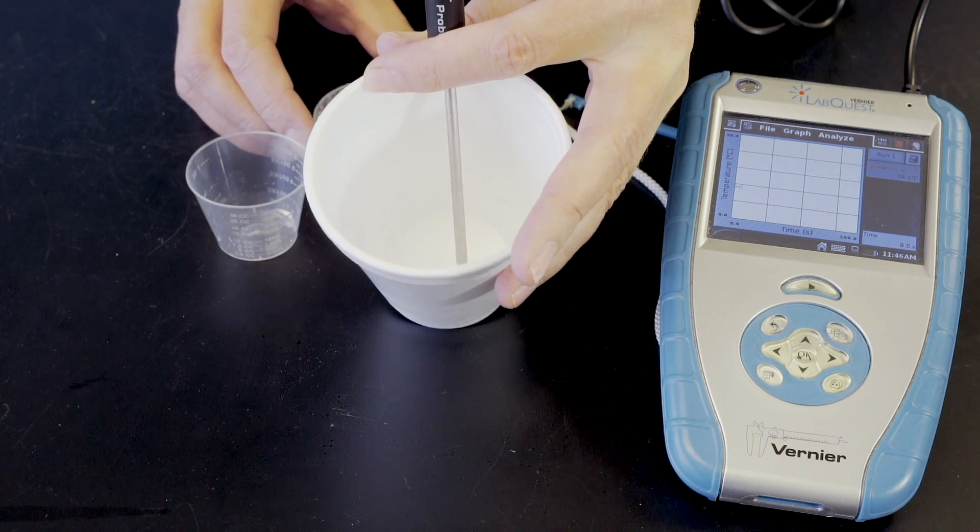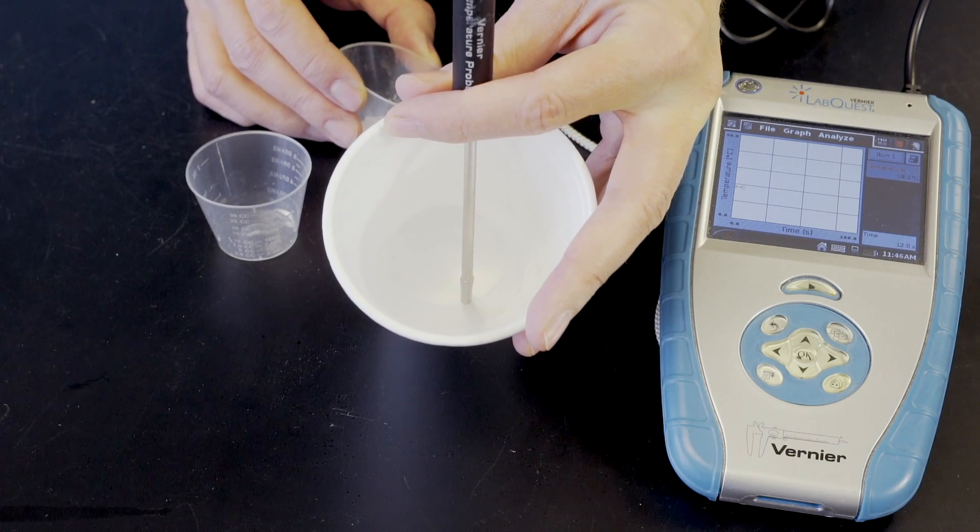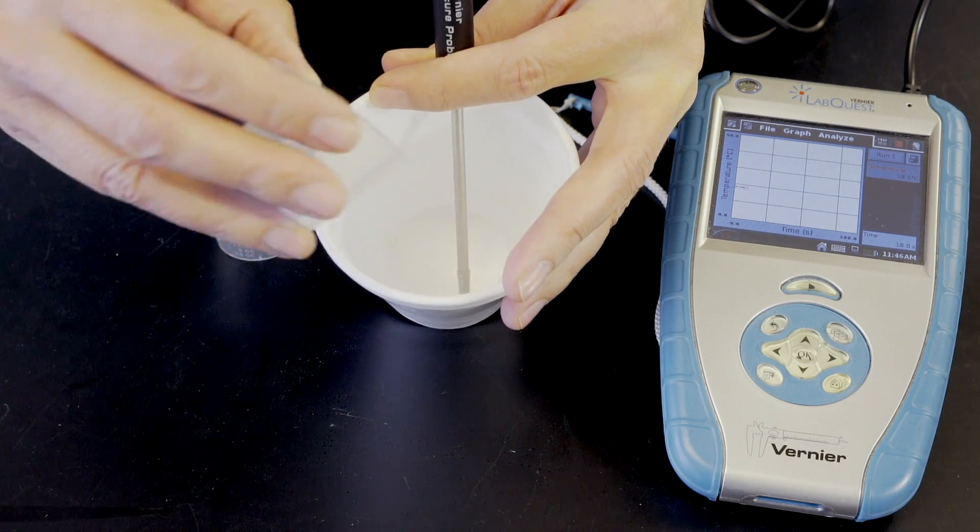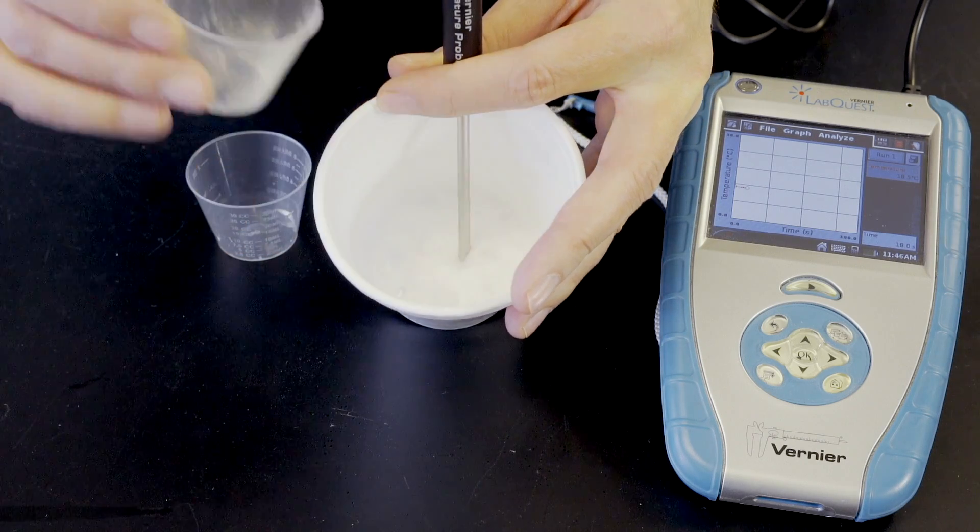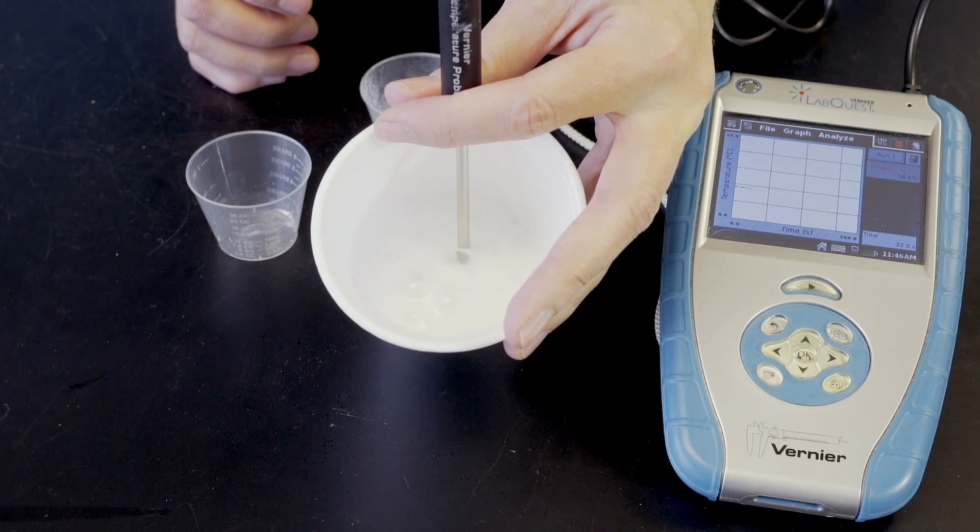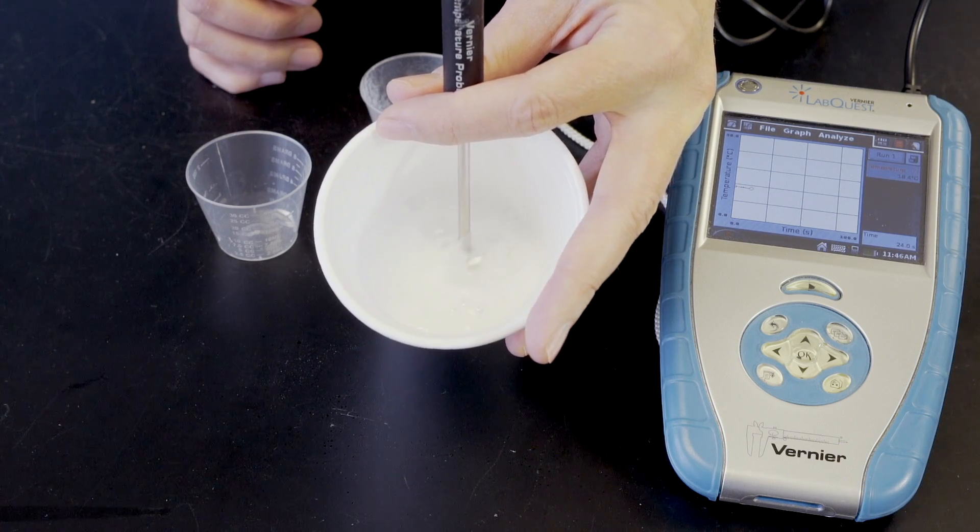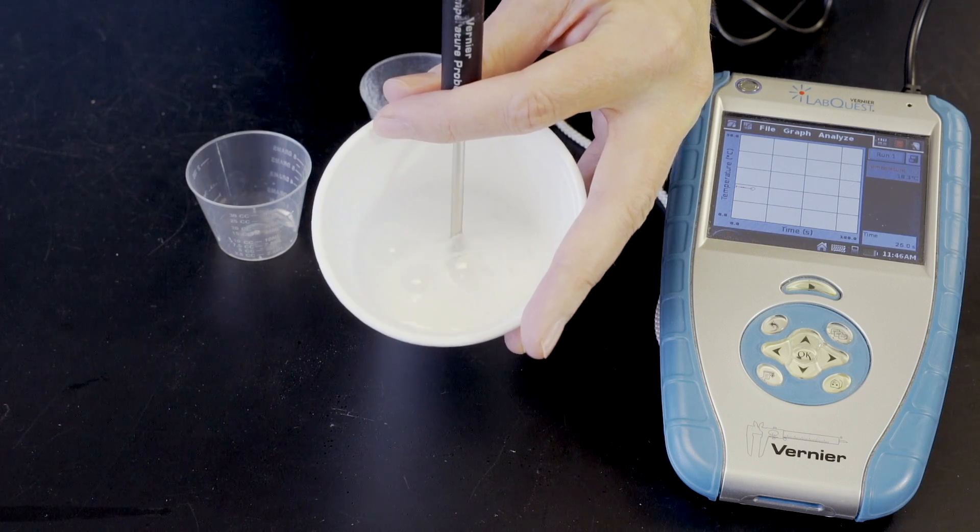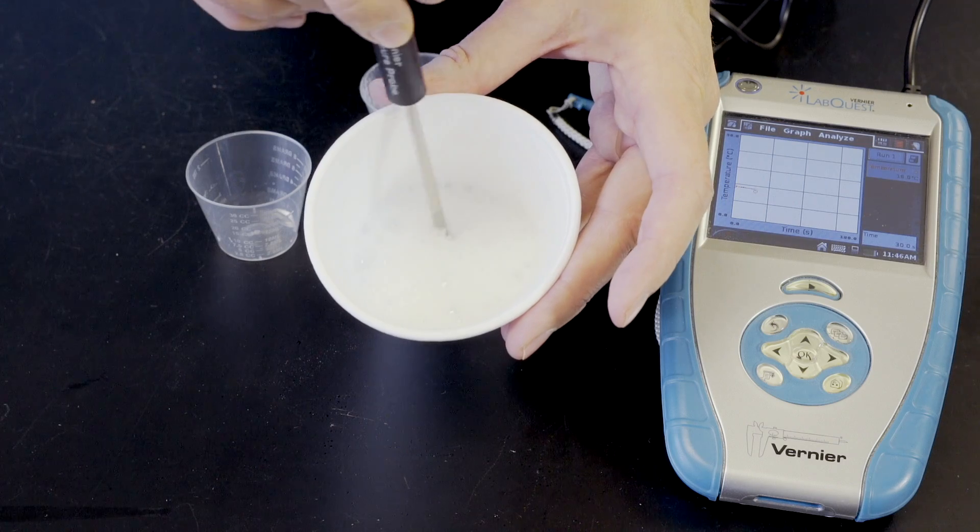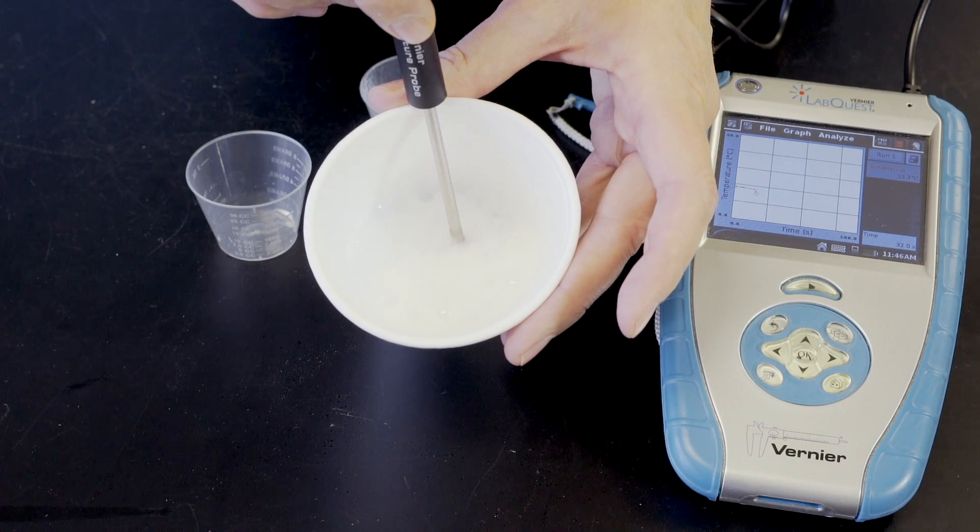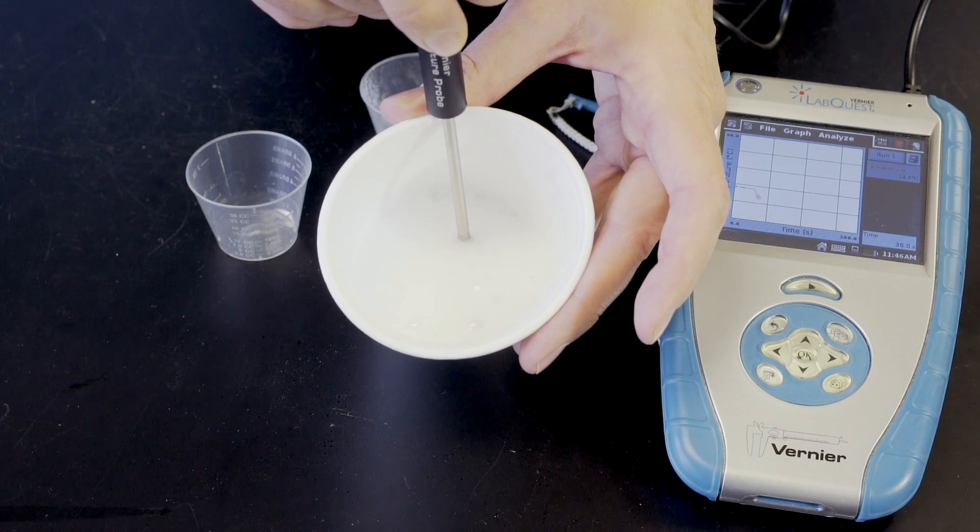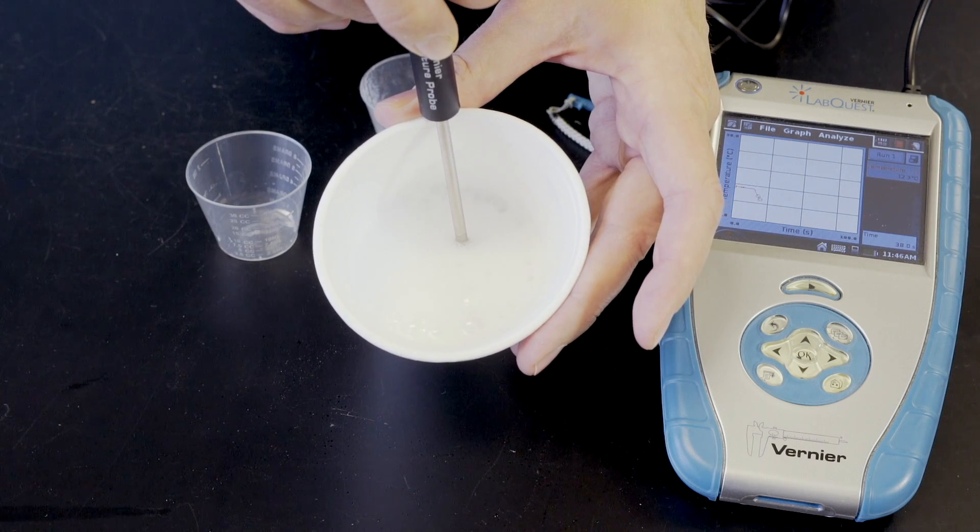We let this record for about 5 seconds until 10 grams of baking soda is added to the acid. I'll gently stir with the temperature probe. Look for the 4 signs that a chemical reaction is taking place that you learned in the last lab.